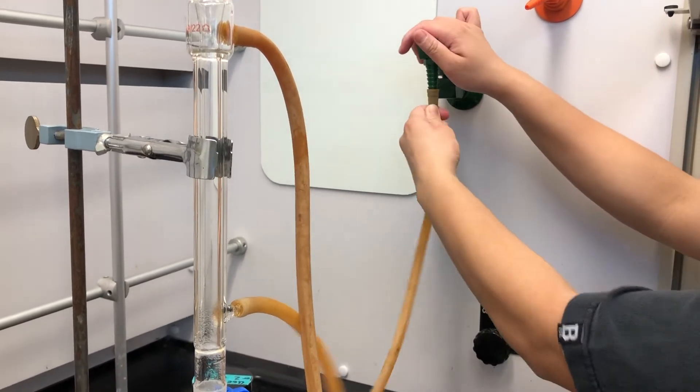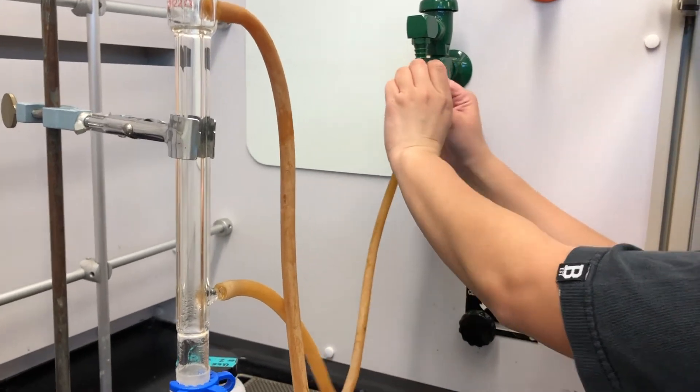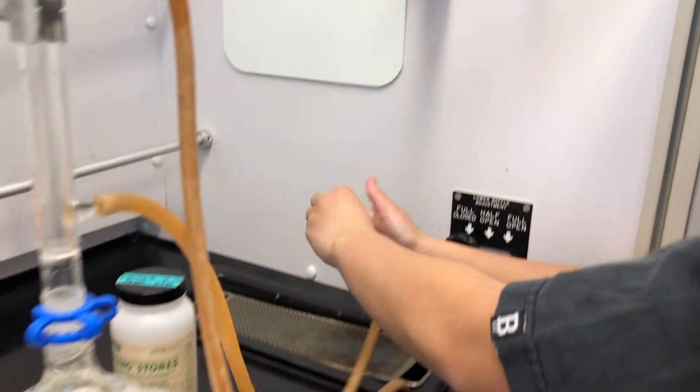Come back to your reflux and take it apart. Turn off the water source and disconnect the parts carefully and accordingly. Then you may turn off the heating mantle.